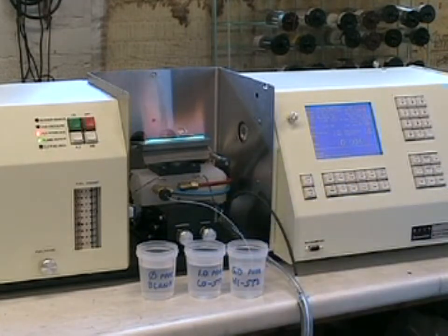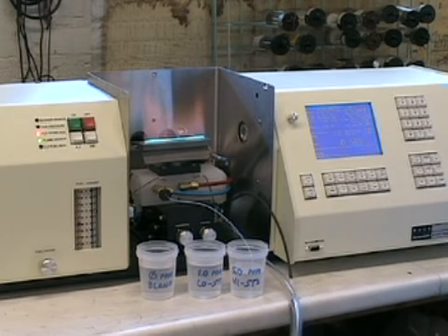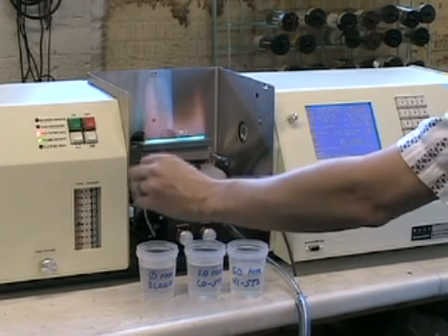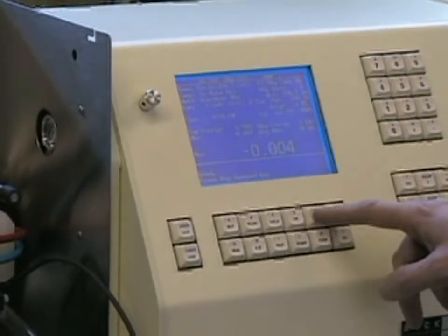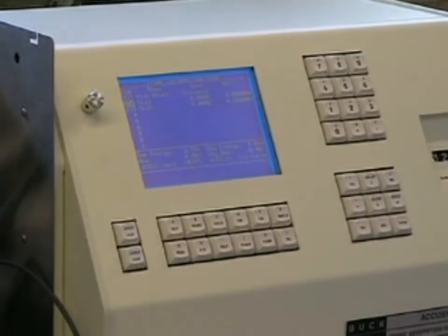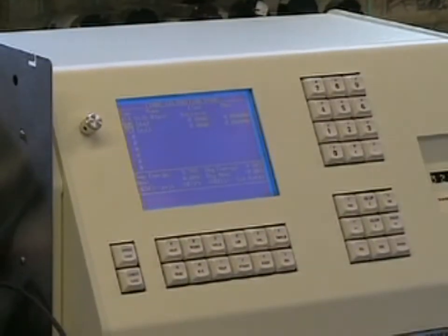This is particularly useful and avoids wasted time for elements such as iron, nickel, cobalt, and manganese that have many wavelengths when dialing in the alignment screen, but only a few of them are actual absorbing wavelengths. In this case for copper, we see we have plenty of energy, so now we may go back into the blank and go into the calibration mode by pressing the Cal key, and here we have a blank calibration table.